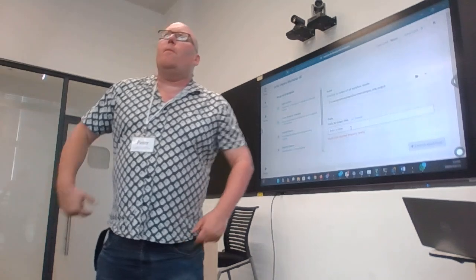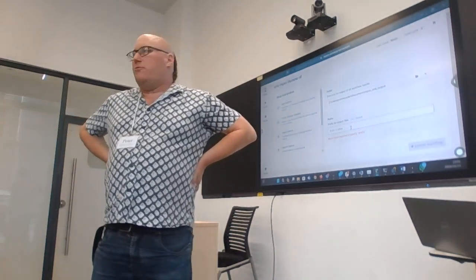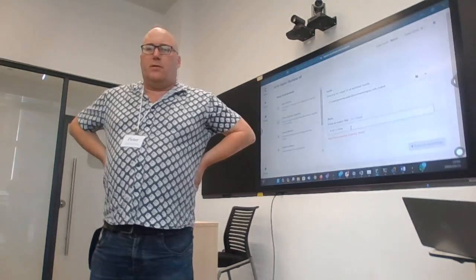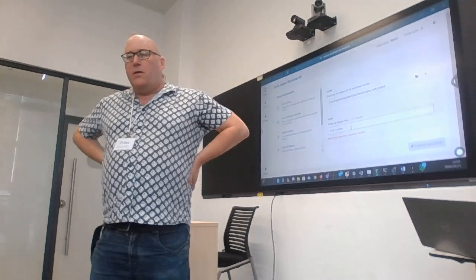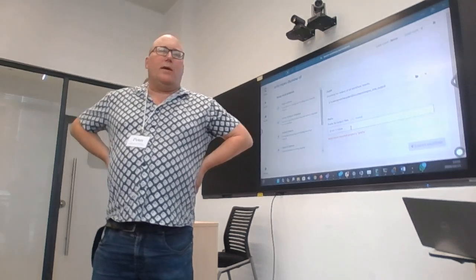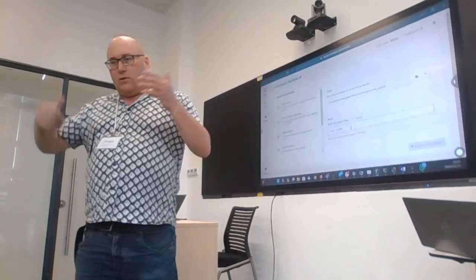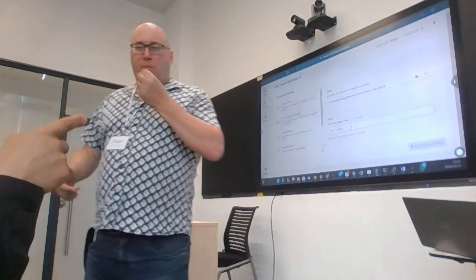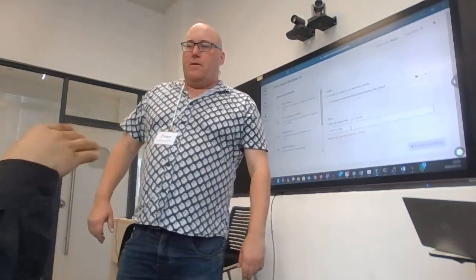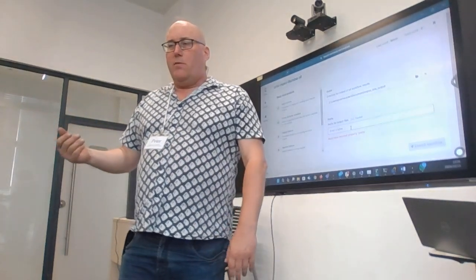Because the inferred ancestor of Mpox 1 and 2 is very far back in time. So Mpox is first seen in humans in 1970, right? Yeah. But the split between clade 1 and clade 2 is probably more than 100 years ago. So there's quite some substantial difference between the two. So they would eventually develop two separate workflows for clade 1 and 2? No, because the bioinformatics technique is the same.